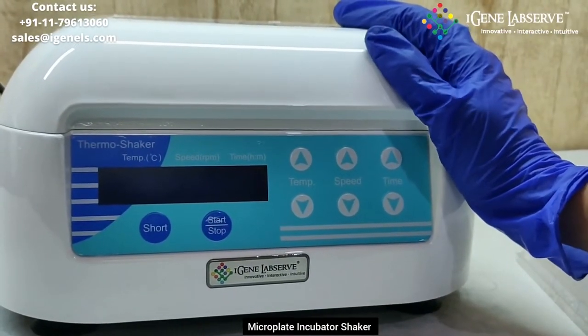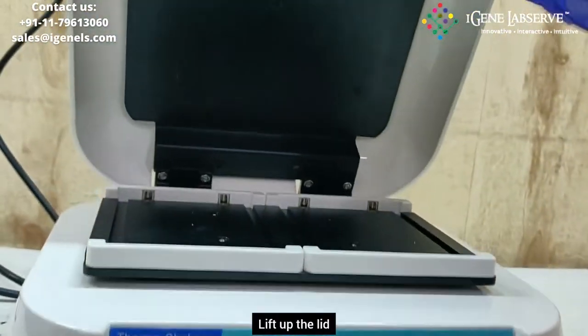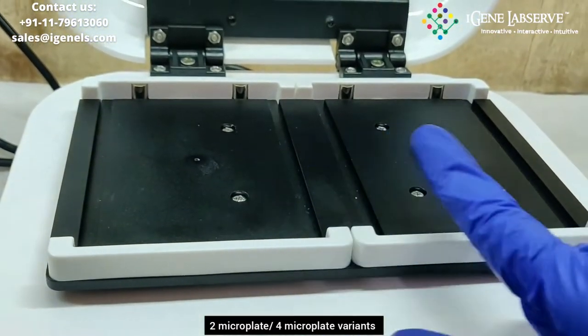This is iGene's microplate incubator shaker. This is a lid, so you have to lift it up. This is the holder for the microplate, and this is a 2 microplate model.